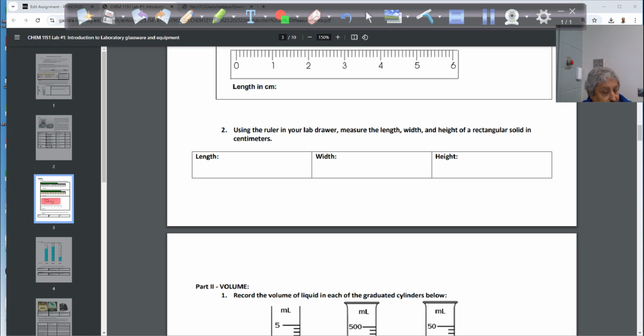Make sense? So for the dimensions, this way is your x-axis, that's your length. Higher up, that's your z-axis. Deep inside, that's your y-axis. Correct? That's the depth or the width. So you write those here, and try to get at least some sig figs with the decimal.